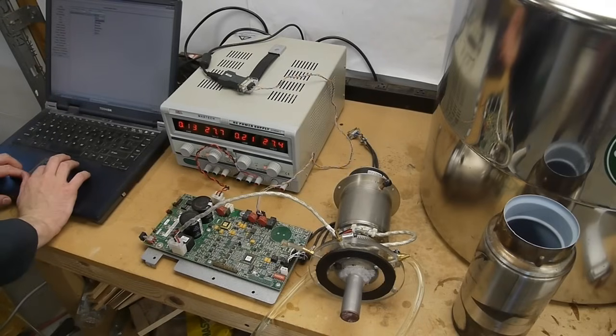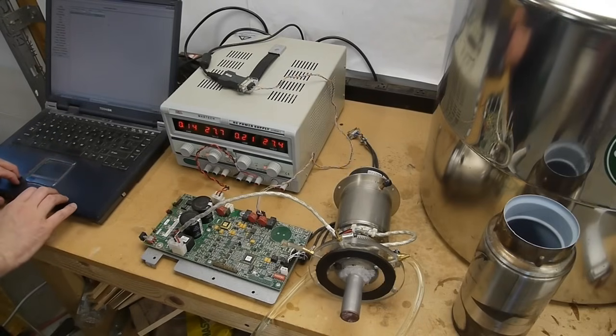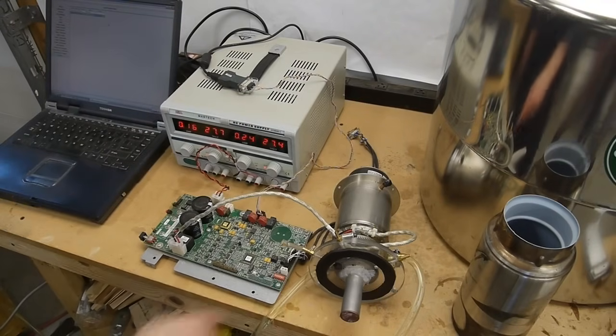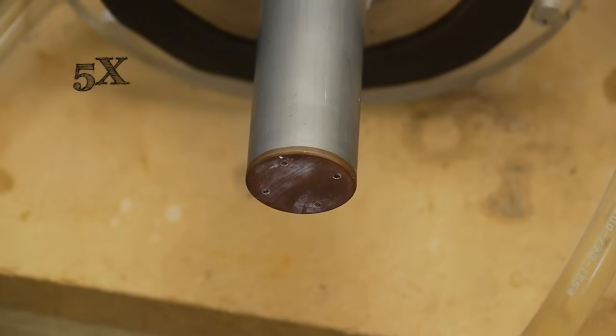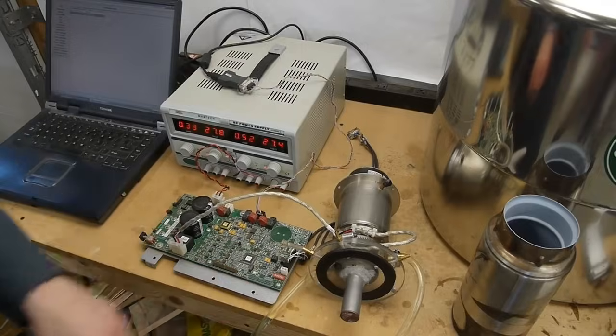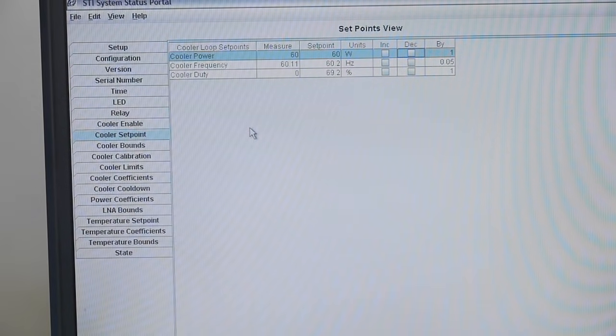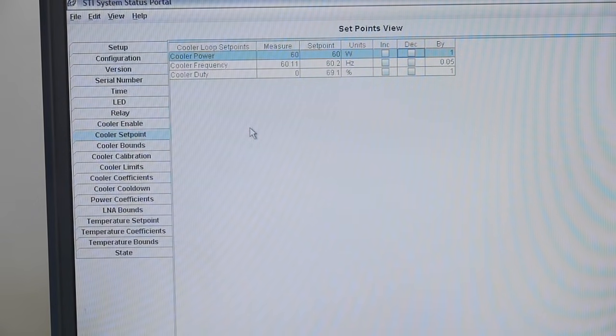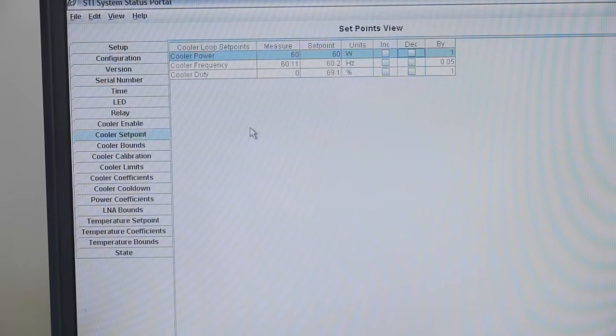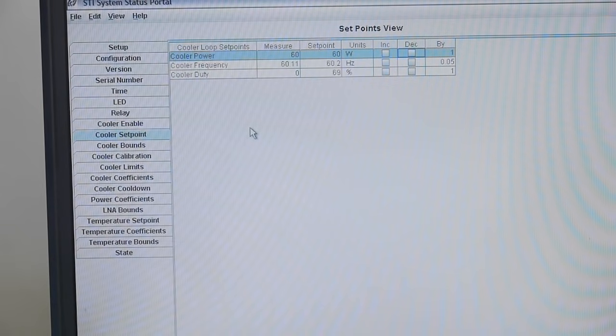Okay I'm going to send the command to start the cool down sequence and you can see that we're drawing power now. I'm going to zoom in here so you can see ice crystals starting to form. The way the system works is it has to ramp up power very slowly. If it went to full power right away the piston inside here would actually hit its limits if the tip isn't cold because the gas pressure is still relatively high. We're currently running at about 60 watts input power.